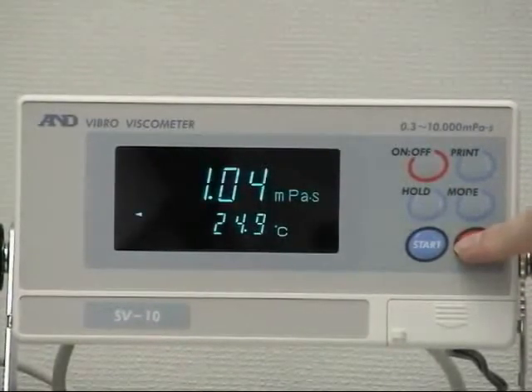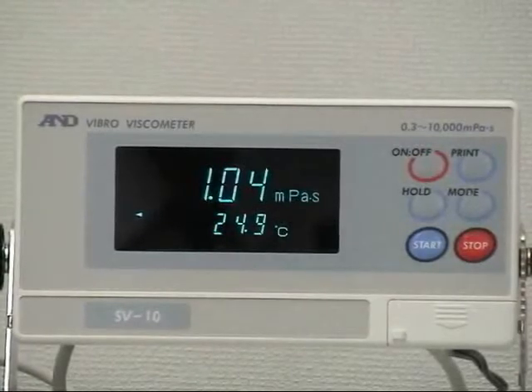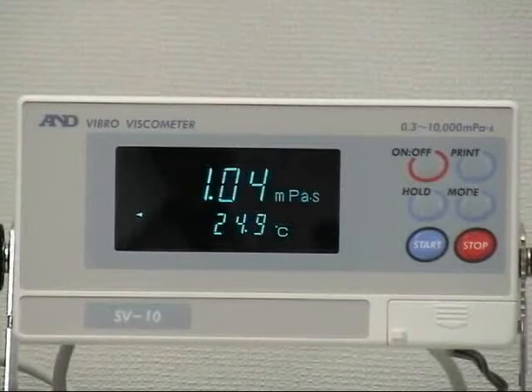Press stop to end the measurement. The processing indicator disappears. The hold indicator appears and the measurement results are frozen.